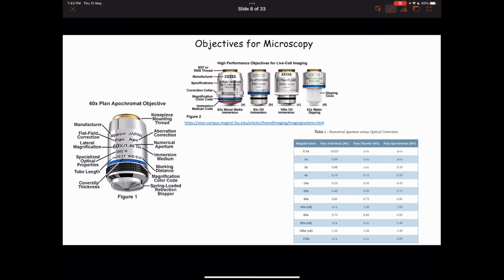So if you are in the position of buying new lenses for your microscope, you should always consider buying those objectives which offer the greatest numerical aperture within your budget. Both numerical aperture as well as objective magnification, along with your budget, matter when you are going to purchase one of these.